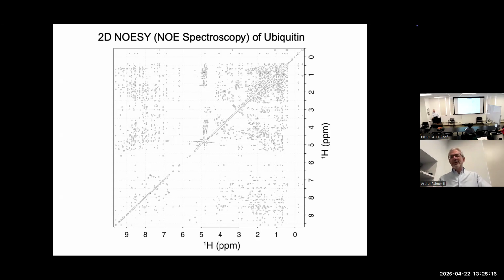So even now, unless the protein is really hard to make, even a protein domain that you could do just by hydrogen, mostly people still label it, because it's so much less ambiguous.